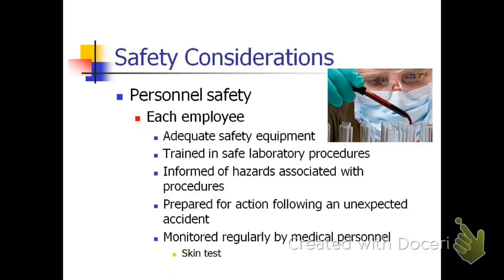Okay, so as a medical technologist, let's say for example you'll be assigned in QI or in a microbiology laboratory, wherein in the future you might handle specimens tainted with Mycobacterium tuberculosis or suspected to have Mycobacterium tuberculosis. It is very important that you observe personnel safety.